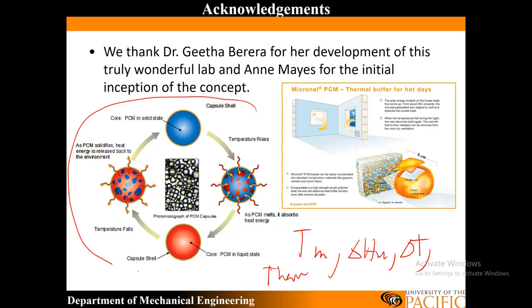This is a nice figure that encapsulates the entire lab. As temperature rises, I absorb heat energy and I'm liquid. As temperature falls, I solidify, exothermic, heat is released back into the environment, and I'm in my solid state.